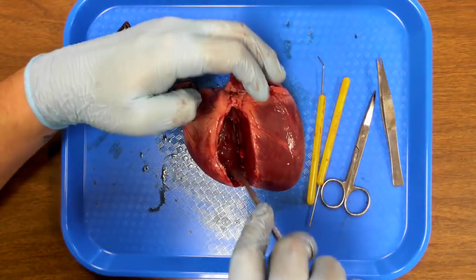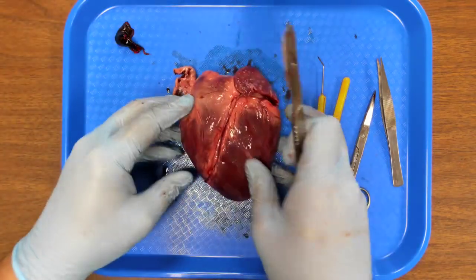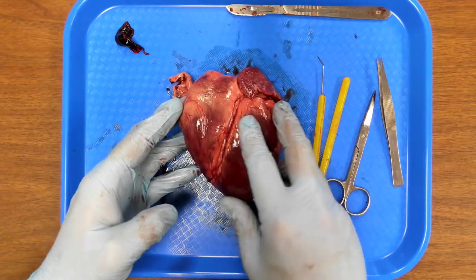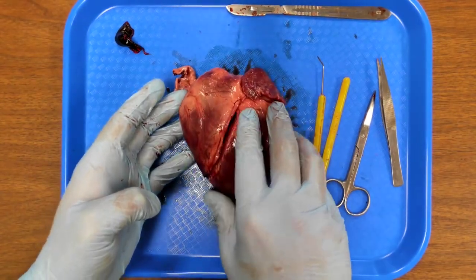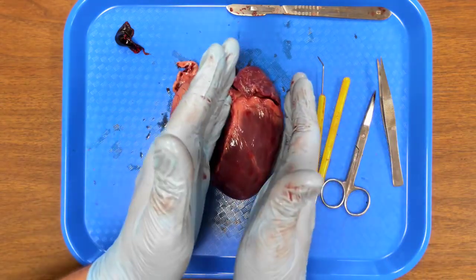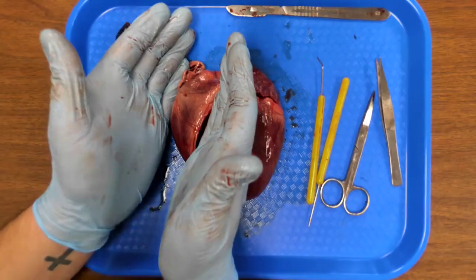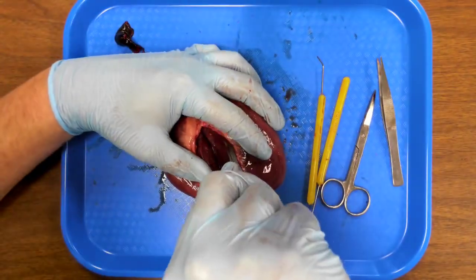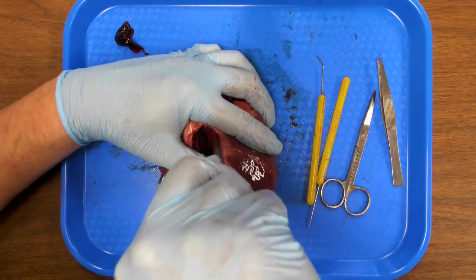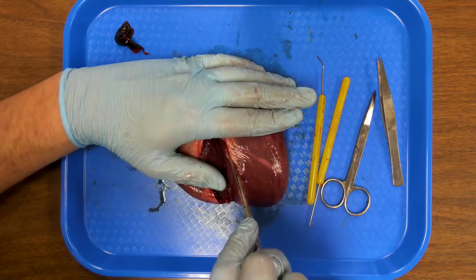Now I'm going to cut even more. I'm going to take a little bit more off the septum here to get inside the left portion of the heart. Remember, look at how much larger the left side of the heart is than the right side. And this is because, again, this side is in charge of pumping to the rest of the body. This side just has to pump to the lungs. So it has to be a lot stronger, a lot more muscular. So I'm going to try to hollow this out, again, without losing a finger.